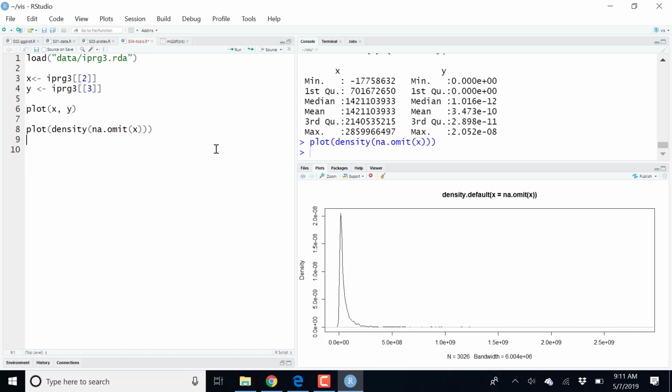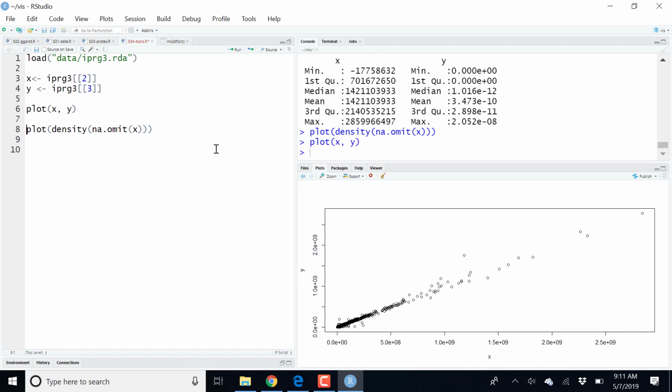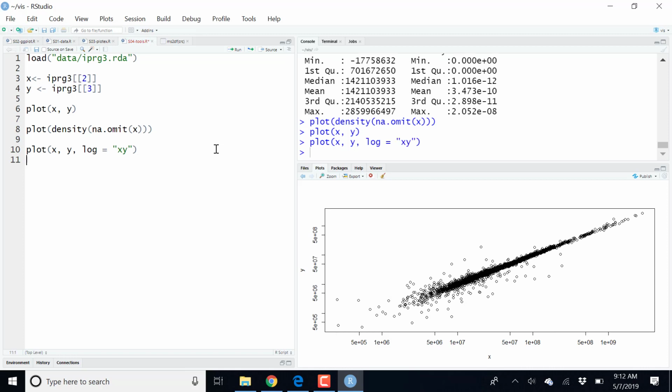And coming back to the scatter plot here, this very often gives a false impression of very good reproducibility, although it's not the best measure of reproducibility, of how well we manage to reanalyze or re-measure the same sample or similar samples. It's much more representative of the actual data to log transform the data.